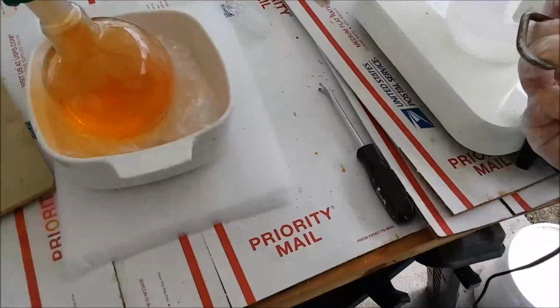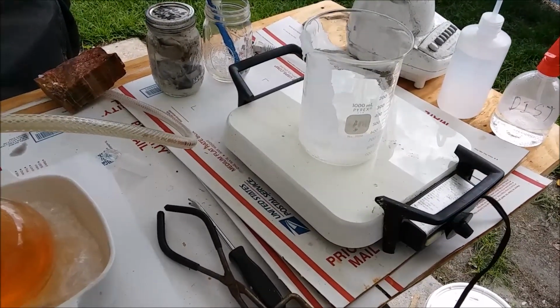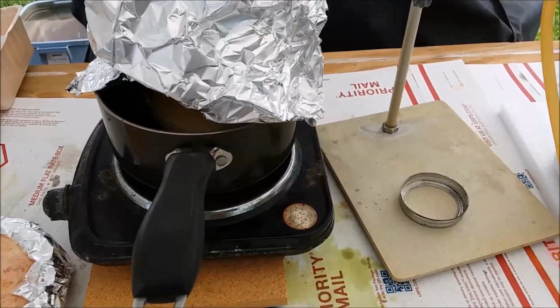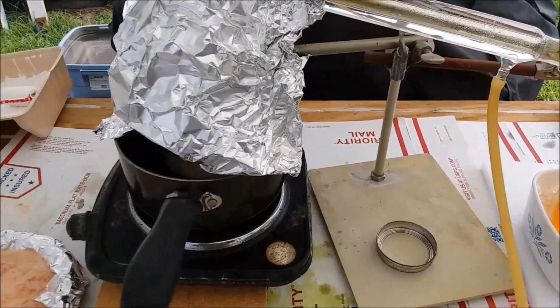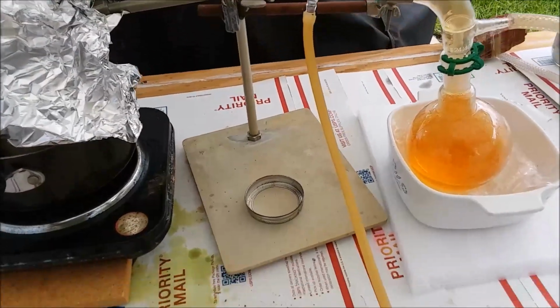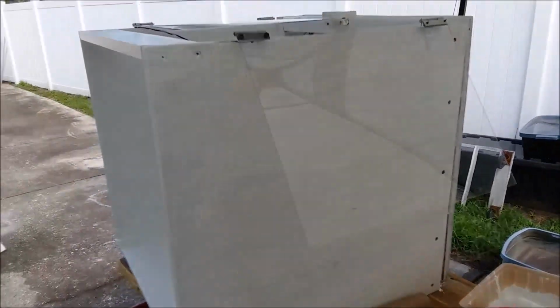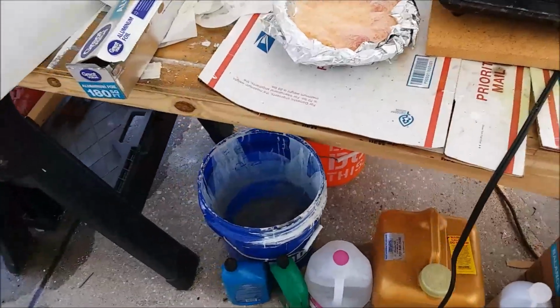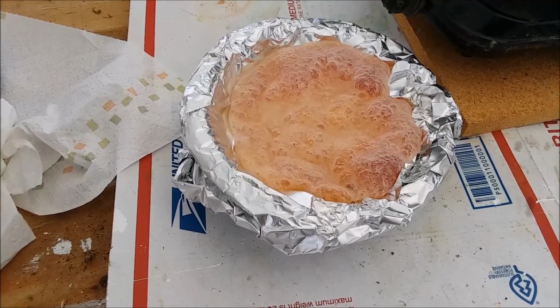I'll do the same with this beaker, though. I'll just fill it with hot water, and I'm sure the small amount that's left in there will dissolve quickly. But I'll probably wait until I get the stuff from this second reaction in it. It's coming along quickly. It started up right away because the oil was still hot. So it's going quickly. Probably be over in not too long. Maybe I have time to get a second coat on the outside of my fume hood. We'll see. That is really interesting. It looks like a souffle, but I would not eat it.